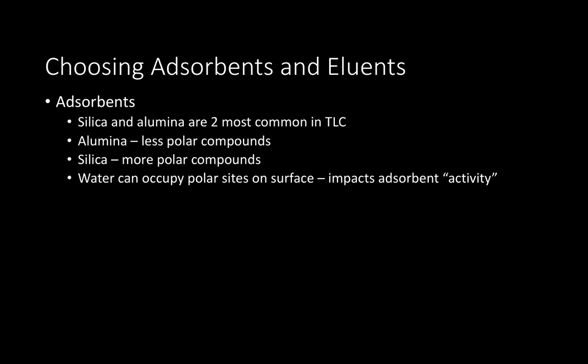polar than silica. Something to note is that water can occupy some of these really polar sites on your adsorbent, which impacts the adsorbent's activity, so how much it interacts with your compounds within a mixture. So a lot of times you'll see notes in your lab book, or you may see me or one of your lab TAs pull TLC plates out of the oven. Sometimes we will put the TLC plates in the oven to make sure that we've evaporated off any water that might skew your adsorbent activity.